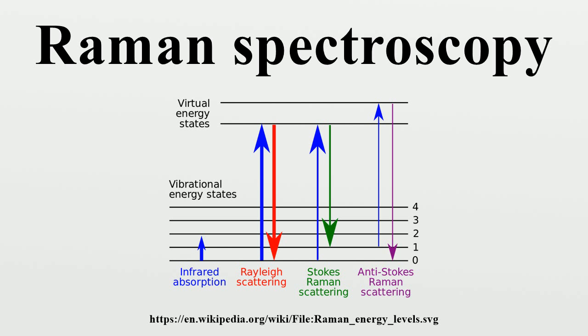Raman reporter molecules with olefin or alkyne moieties are being developed to allow for tissue imaging with SERS-labeled antibodies. Raman spectroscopy has also been used as a non-invasive technique for real-time, in situ biochemical characterization of healing wounds, and multivariate analysis of Raman spectra has enabled a quantitative measure of wound healing progress. Raman spectroscopy has a wide usage in studies of biominerals.